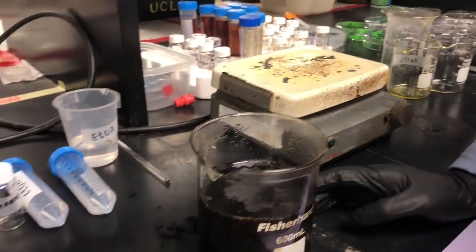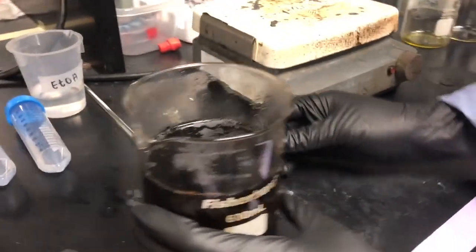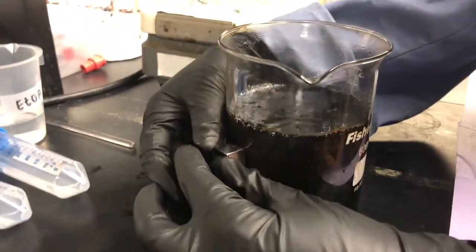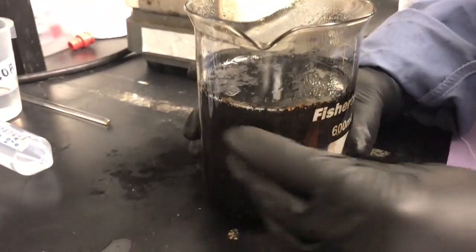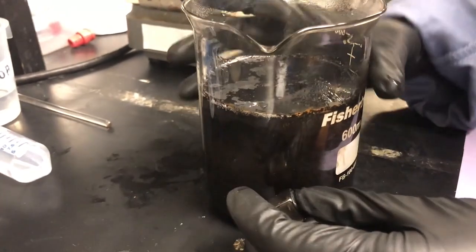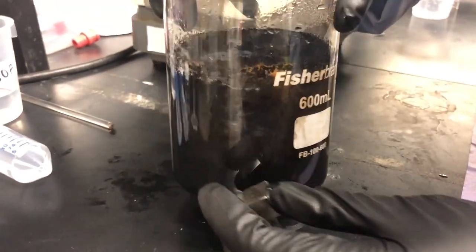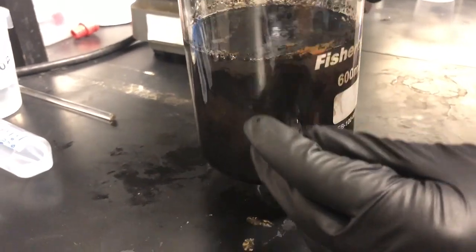So at this point, make sure your hot plate is turned off, and we'll begin using the magnet to remove the magnetic nanocrystals. You can rub it around the beaker a little bit, give it a little swirl even, and this will help the solution come closer to the magnet and pull out.